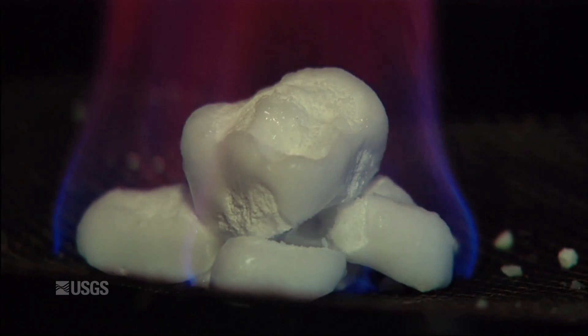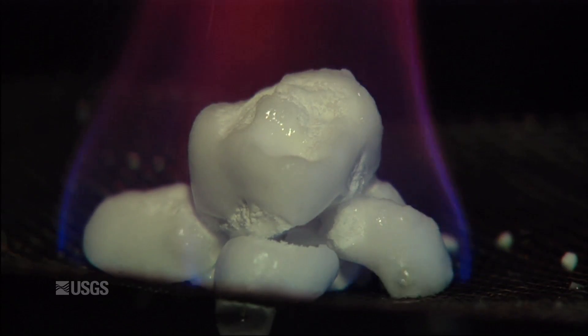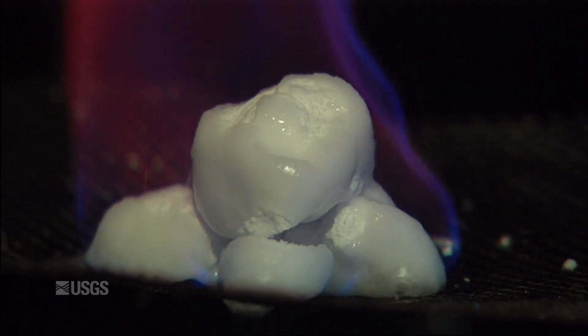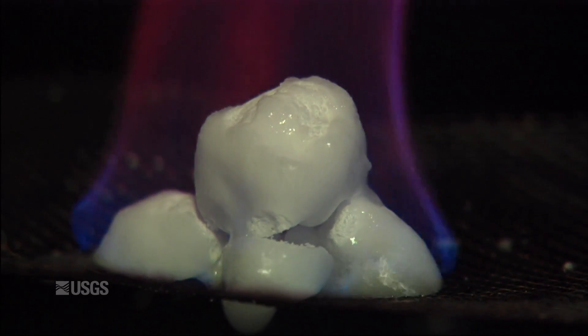So it's decomposing to ice plus gas. The gas is flaming and the ice will soon melt to water. And you can see it's not just a pile of snow — these samples contain abundant amounts of natural gas.